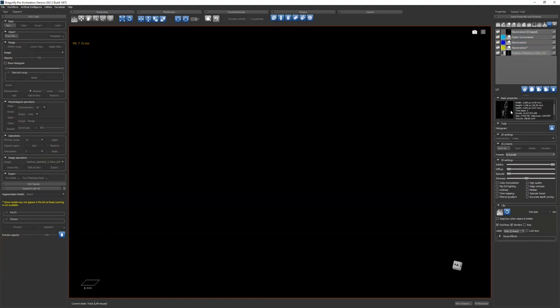But when you look at the basic properties, it shows you this preview, and that's the orientation the original data is in. So I think it is just because it was scanned obliquely, but I'm not 100% positive. And you would only do that really for that purpose, to pass it on to someone. If you were to work on this data set in Dragonfly again, you wouldn't need to do that. Right. Okay. I'm gonna pause this.